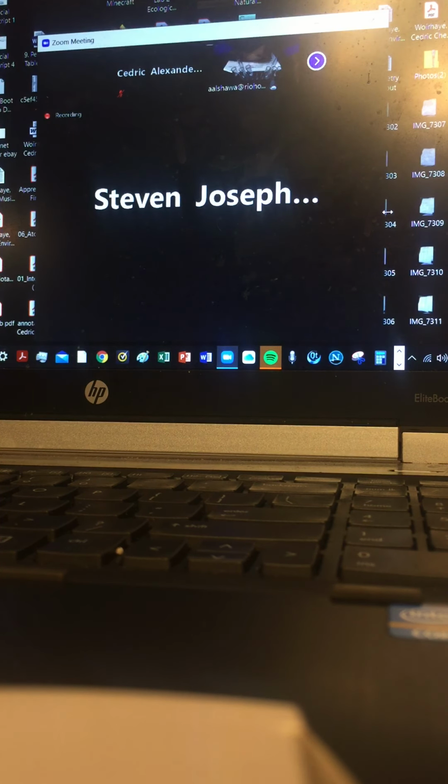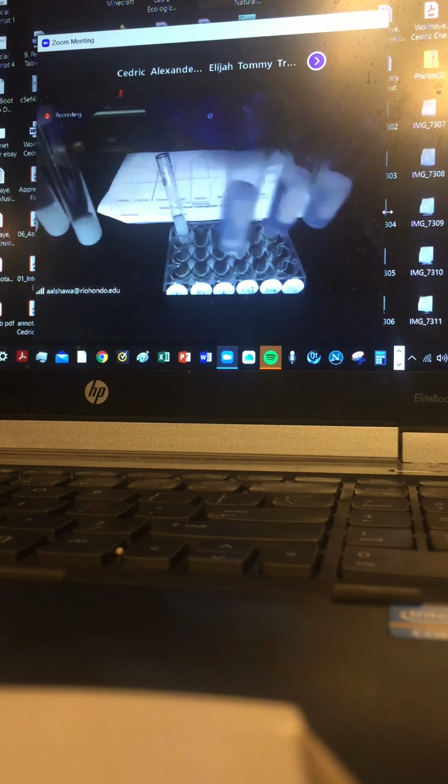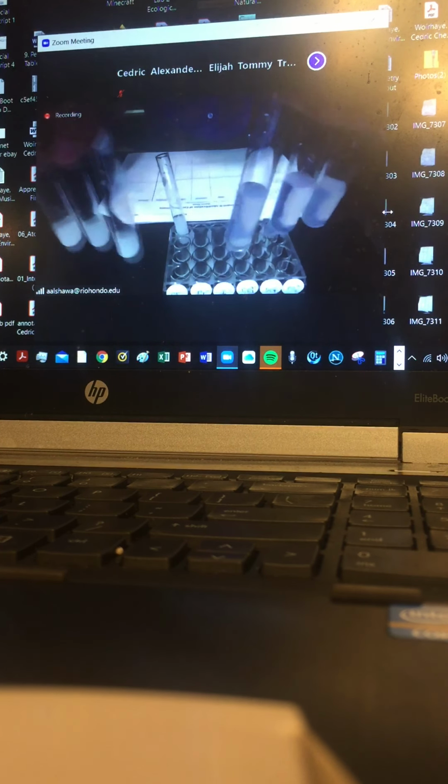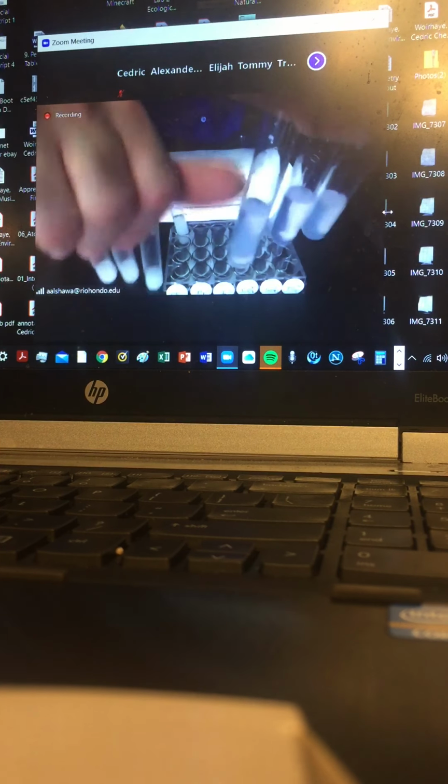All of the ones that you've done so far, it looks like there's a distinct coloration difference between the first 3 and the second 3, but they all pretty much look the same from the zoom camera. Yeah, so they all looked the same. But remember the step right before the addition of the acid, they look different.